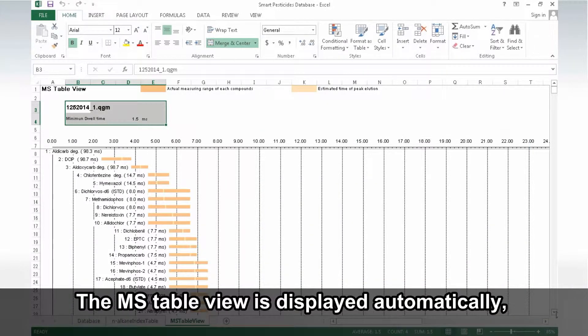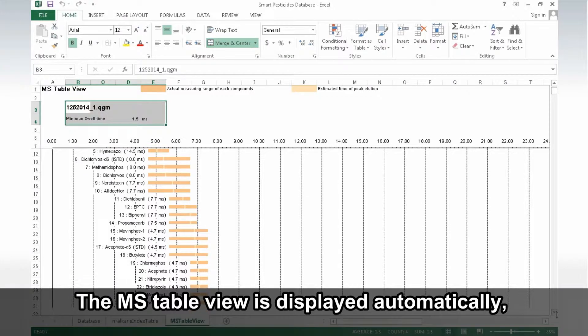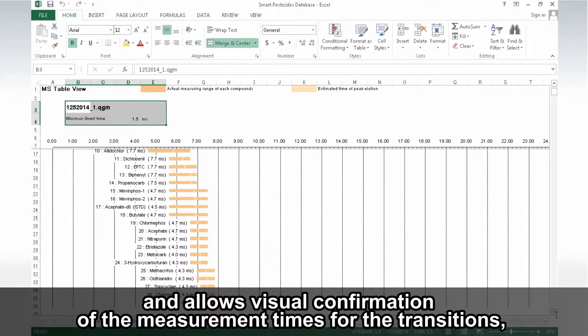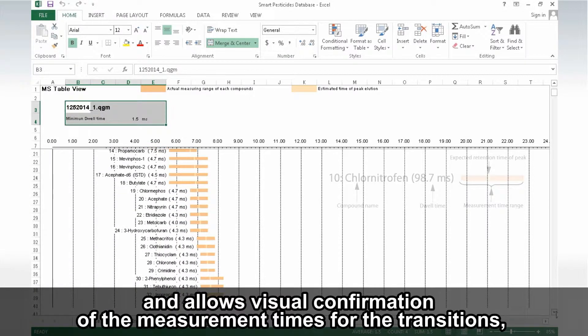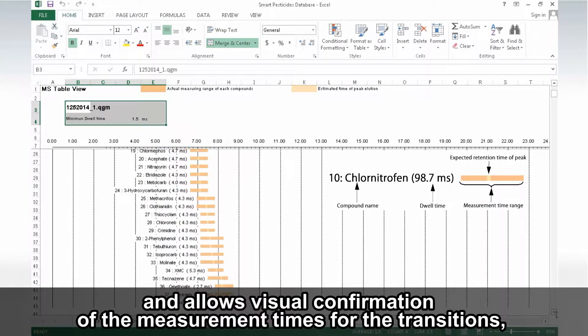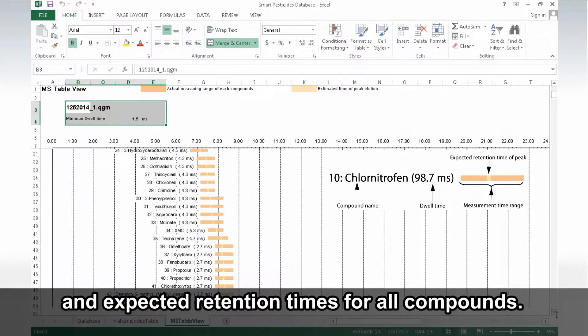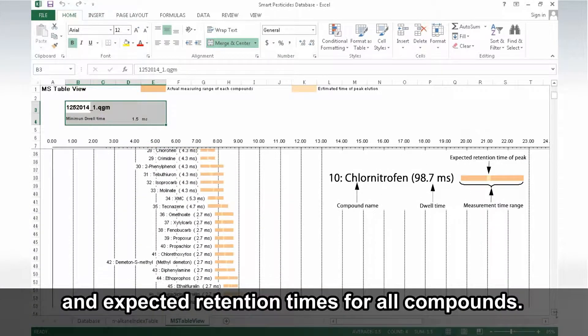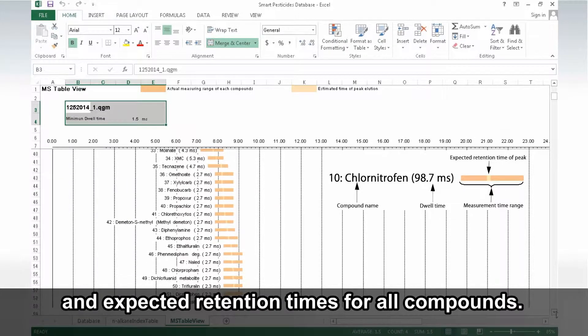The MS Table View is displayed automatically and allows visual confirmation of the measurement times for the transitions and expected retention times for all compounds.